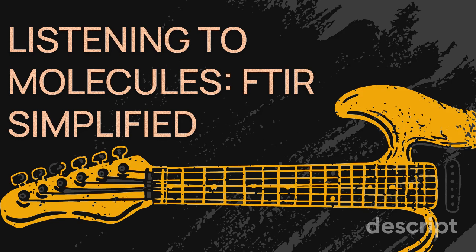This is also fascinating. We've covered a lot of ground here, and I'm really starting to appreciate the power of FTIR for understanding protein structure and dynamics. But before we go any further, let's take a moment to recap what we've learned so far. All right, so we started by exploring how FTIR works, how it uses infrared light to generate a unique fingerprint for each molecule. We talked about the importance of data analysis, especially baseline correction and peak deconvolution in extracting meaningful information from the spectrum. Then we focused on how FTIR, specifically the amide I band, helps us understand protein secondary structure, the alpha helices and beta sheets that are the building blocks of a protein's shape.